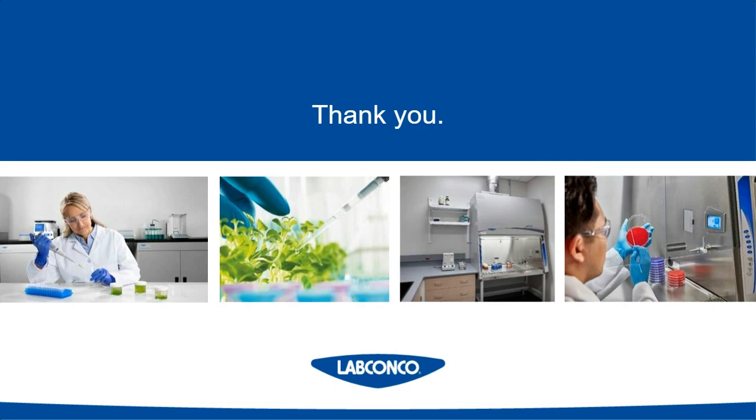Our first question here is, how do I know if the amount of fuming chemical I am using requires an A2 with canopy, or if a B2 or C1 would work? That's a really great question. And this is another area where your institutional EH&S committee can help out.